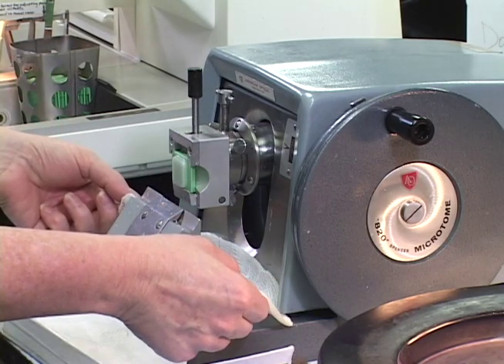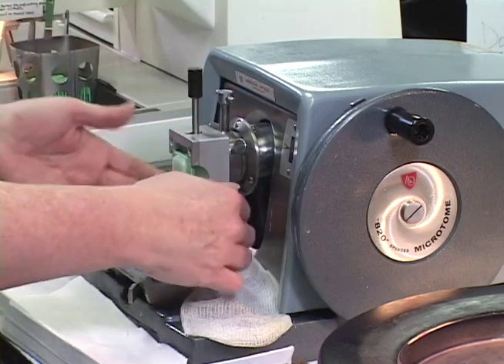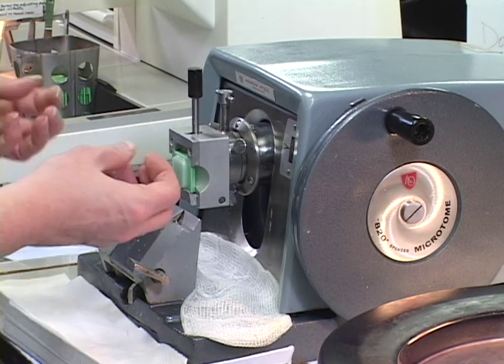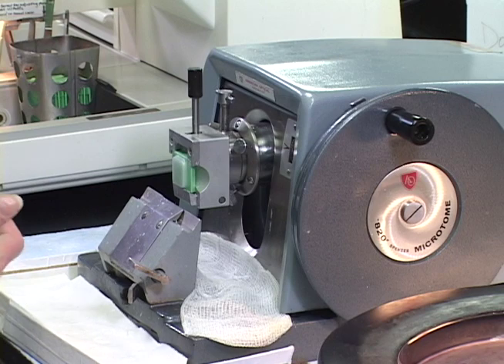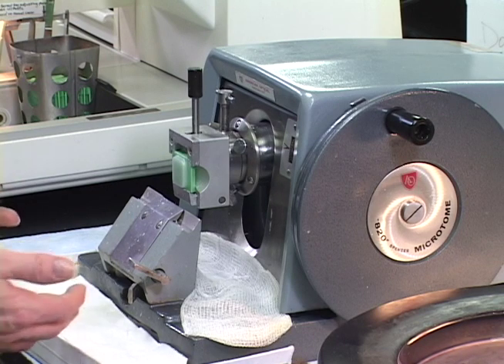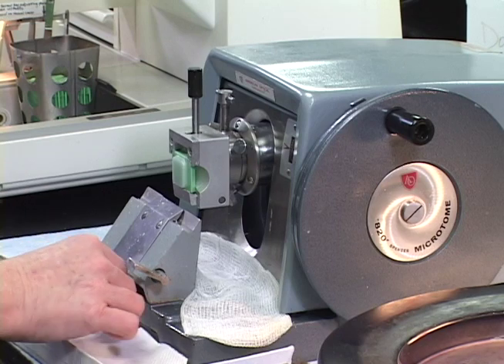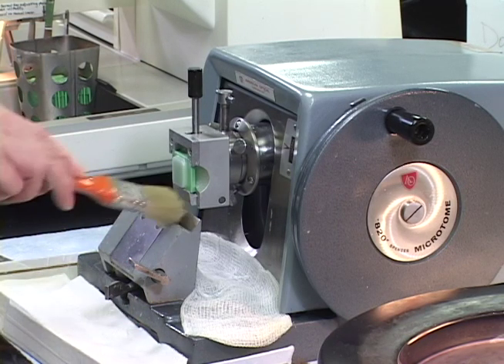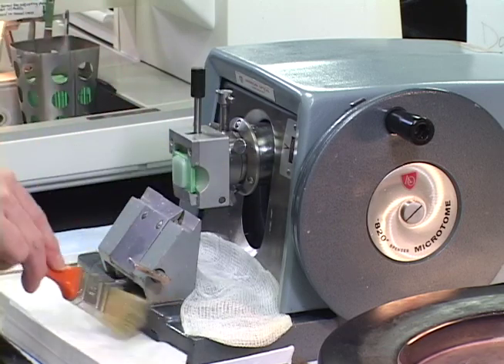I like to keep a piece of gauze here, and it keeps all that paraffin and junk, and then you can just easily pick it up and throw it away and put another piece of gauze. You don't have all that gunked up paraffin under there or moisture getting in there. It really seems to be a no-brainer way to keep this area nice. I also have included a nice brush, so that lets you brush some extra paraffin and things off as you want it.